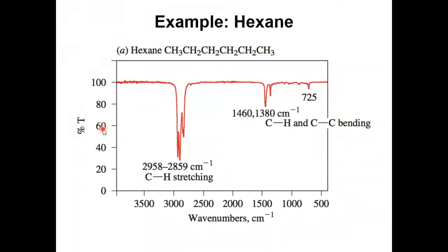The spectrum can also be given in the form of absorption. With absorption, it is similar to NMR, and the peak goes upward. With transmission, the peak goes downward. Here we are giving the infrared spectrum in the transmission form, so the bigger the downward peak, the stronger the absorption.